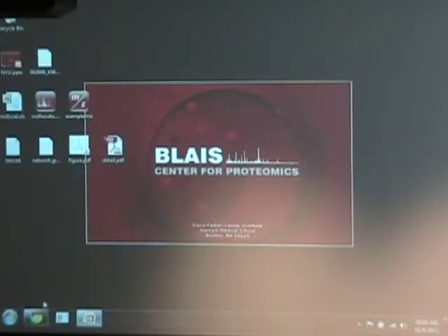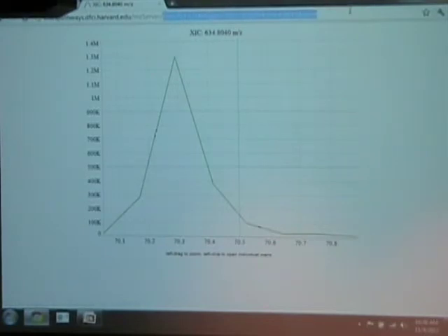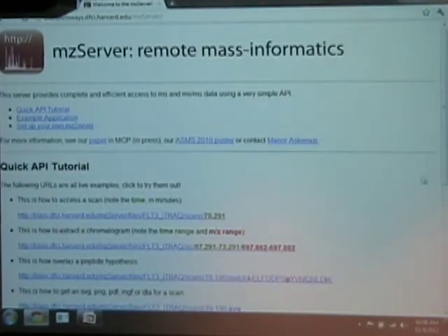So what you do is you go to the MZ server website. Here, let me just situate this. We don't actually want the spectrum, we want the site. If you go here, basically what you need to do is you download one zip of various little files, you download multipliers, and you download, so you either have an instrument, in which case you're done.